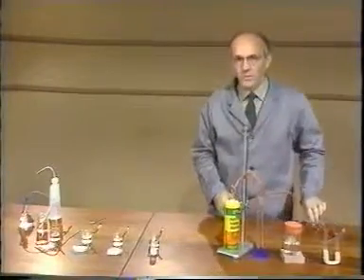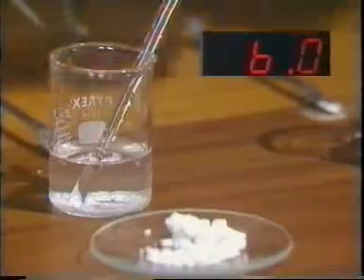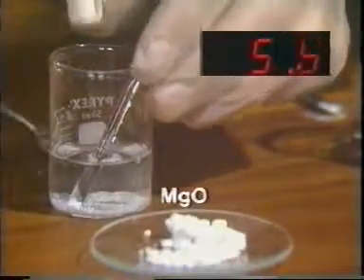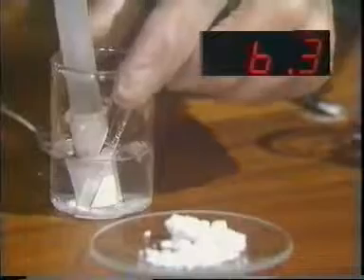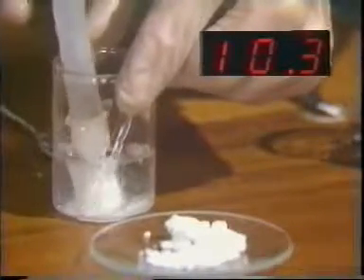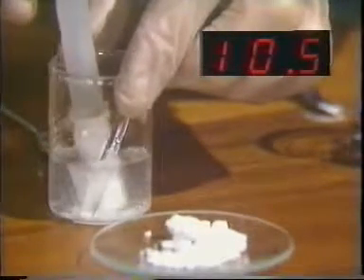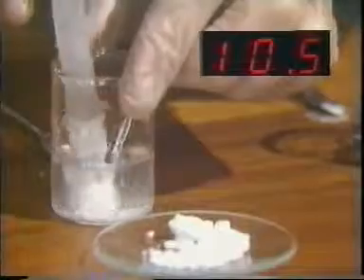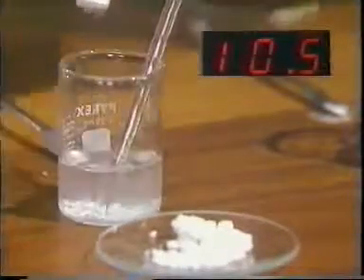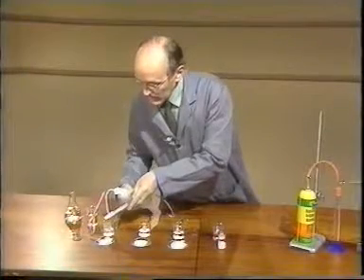Now I'll measure the pH of the solutions, starting with magnesium oxide. And you can see the pH here is about 10.4, 10.5. So although we thought there was no reaction before, it's fairly evident that there has been one.